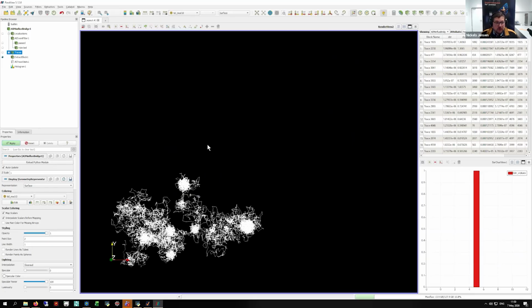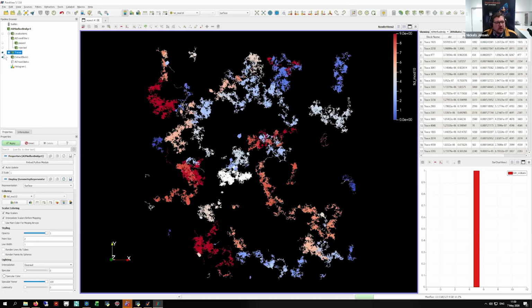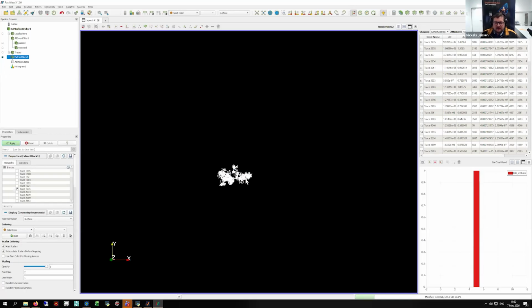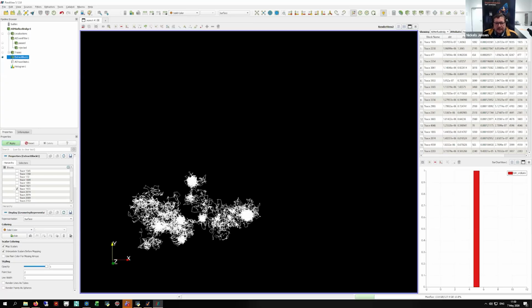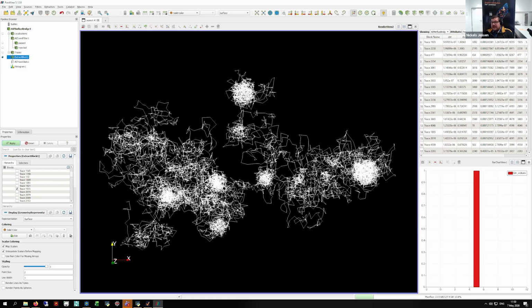Here you see all the traces. But we could also extract the blocks, decide for this trace, and take a look at the single trace. And there you already see how differently this trace behaves.